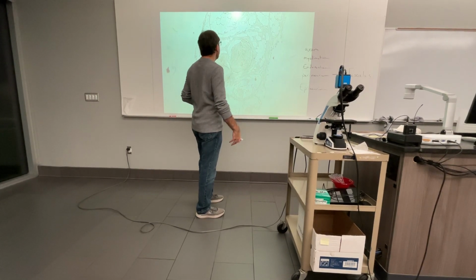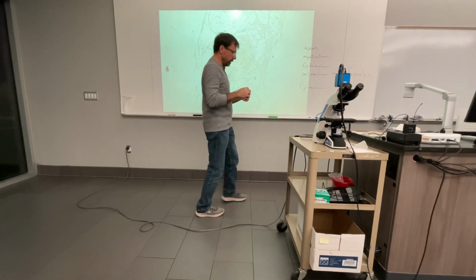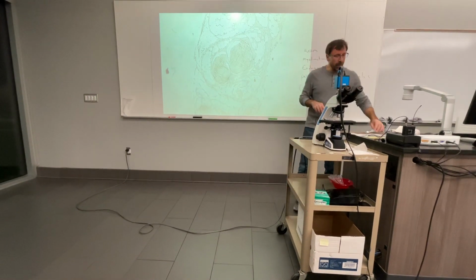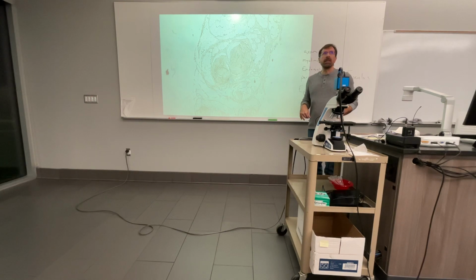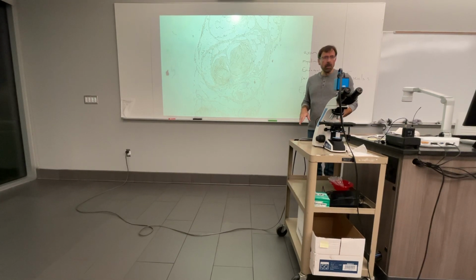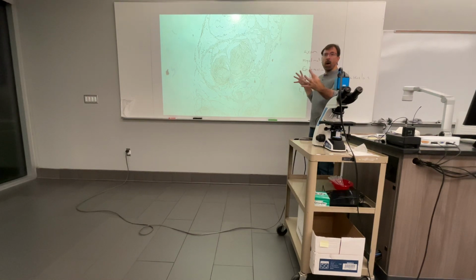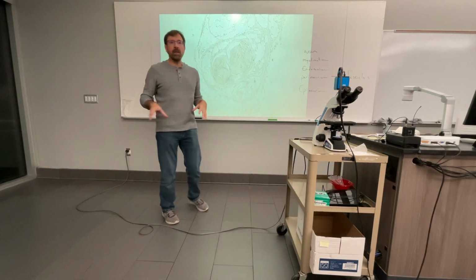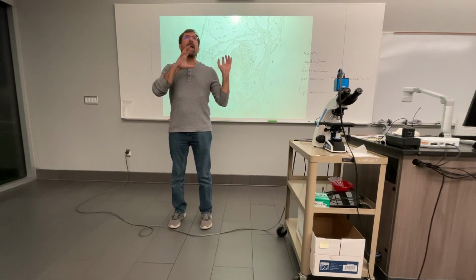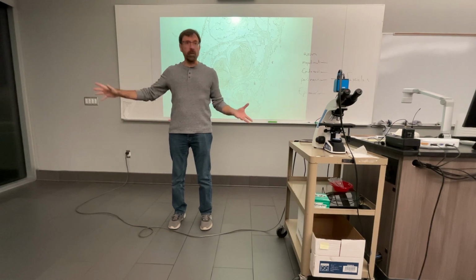Okay? Now, when you're looking at one of these intact examples, it gets a little confusing because when you start trying to figure out layers, if you start from the outside and start working in, it's like there's too many layers. And so for these, it's better to work from the inside out. And the reason why it looks like too many layers and gets confusing, you need to realize that your neuron or your nerves are very similar to your blood vessels.